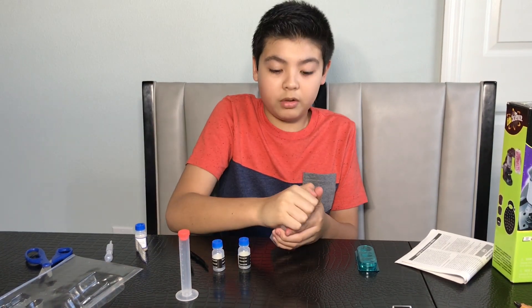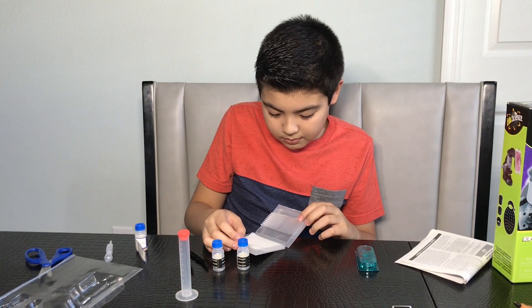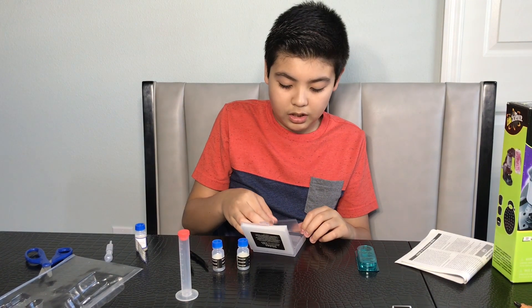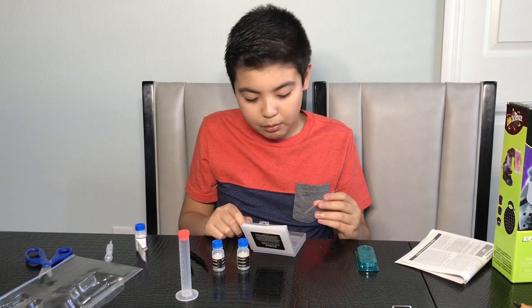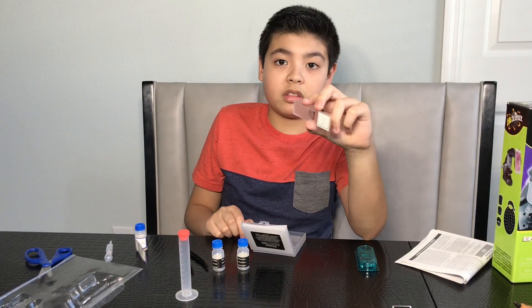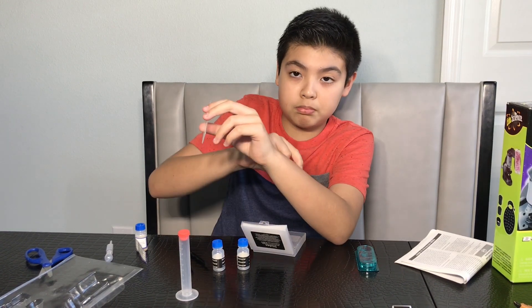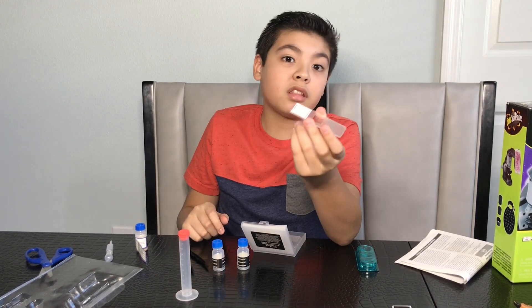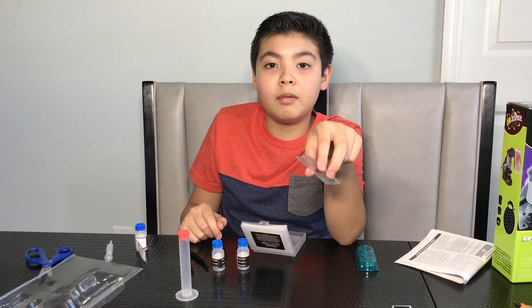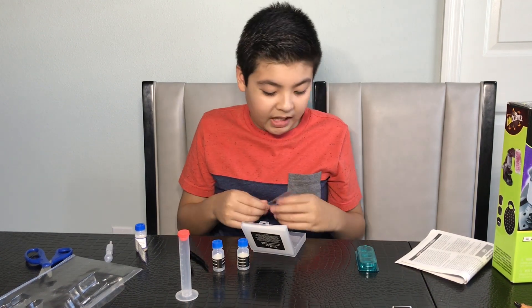Now we're going to show you the slides. So what is this one? Onion bulb epidermis. You only get one prepared slide. I'm not really familiar with the onion bulb epidermis, but I guess epidermis means like skin — so I guess it's onion skin. I actually had a project in school where you need to look at onion skin. Wow, this is perfect! Thank you, EduScience.